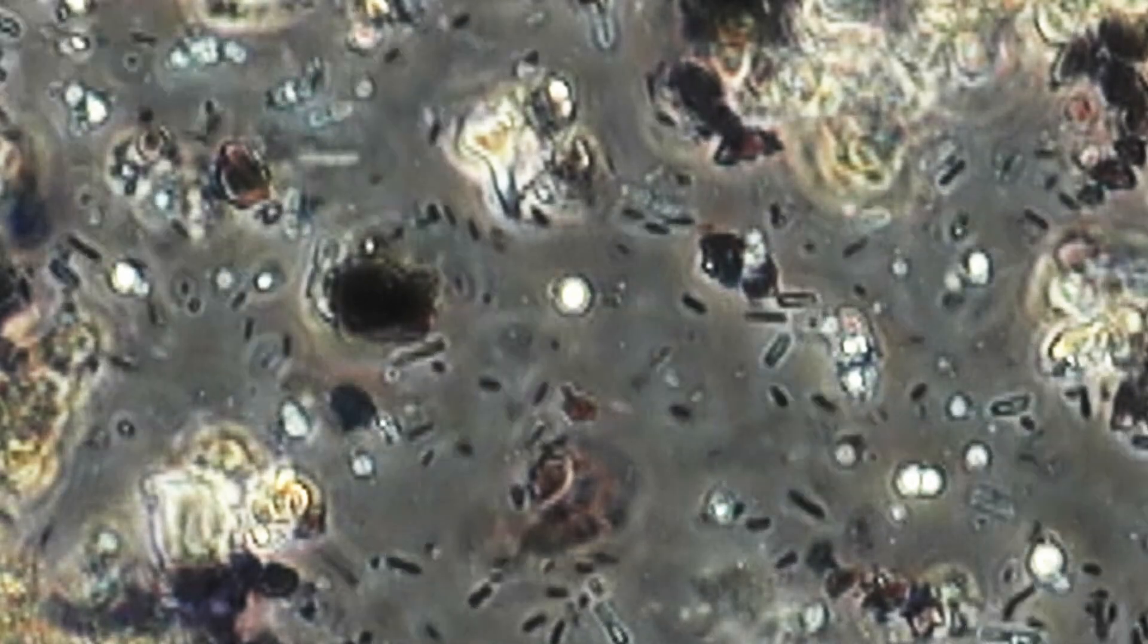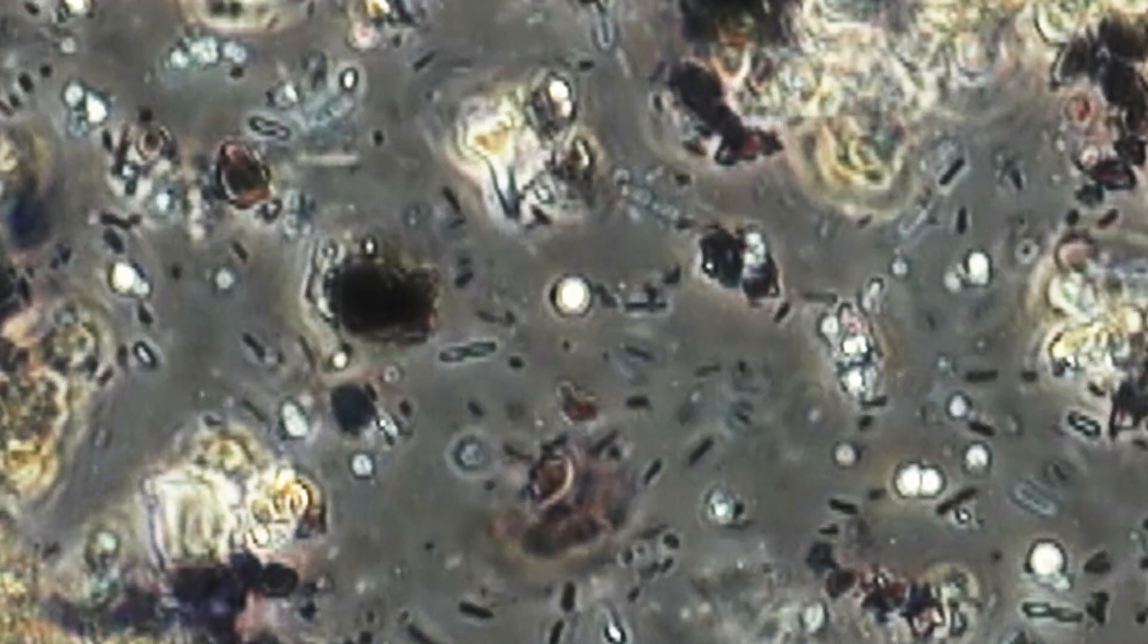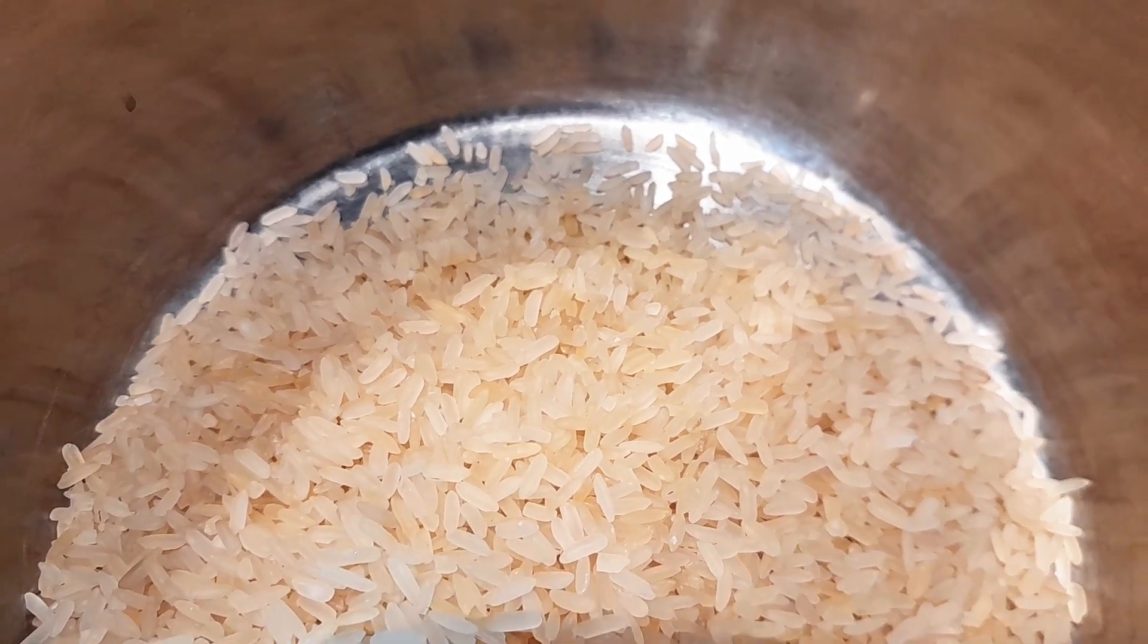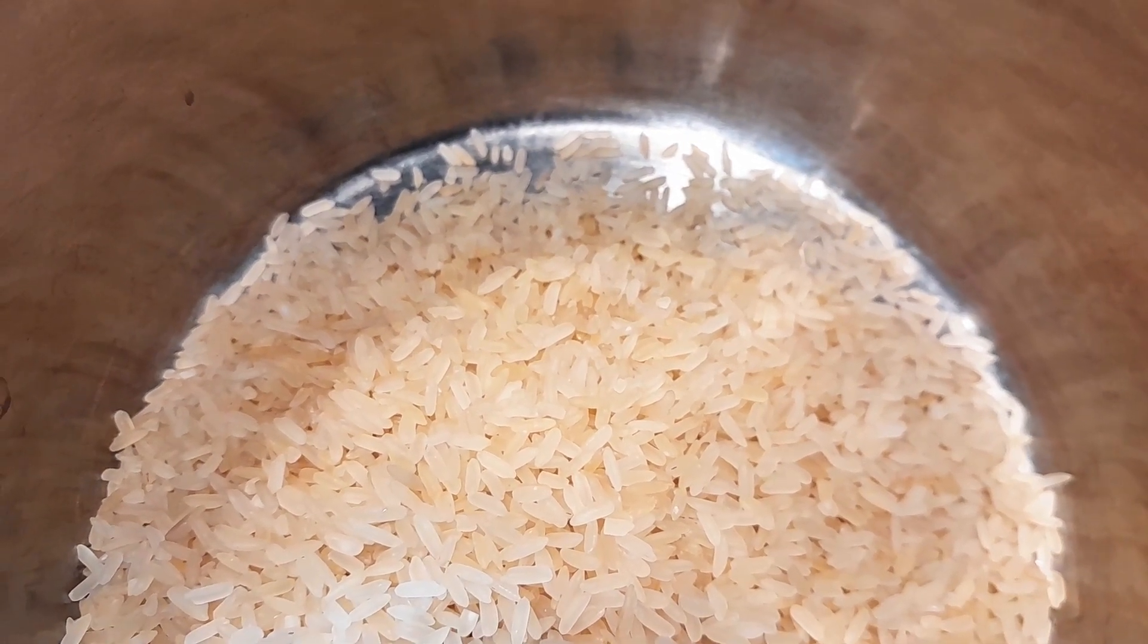And this was a little bit unexpected for me. Why are there so many bacteria in the rice wash water? Is the rice contaminated? Kind of difficult to believe because the rice itself was fresh from the package.